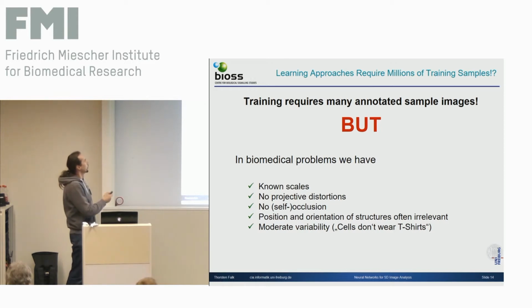So, actually, I talked about 10 to 20 images. In biology, this is sufficient. And you don't even need to annotate the whole images. But annotation must be pixel accurate if you want to get segmentation. And that's quite some effort. If you tried to paint all cells in an image of 1024 by 1024, then you know that it takes time. And that's the reason why we want to get rid of annotating too much.